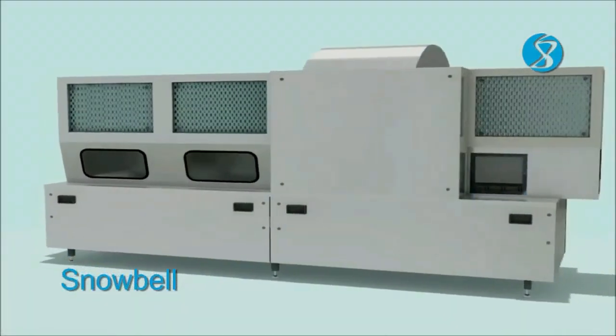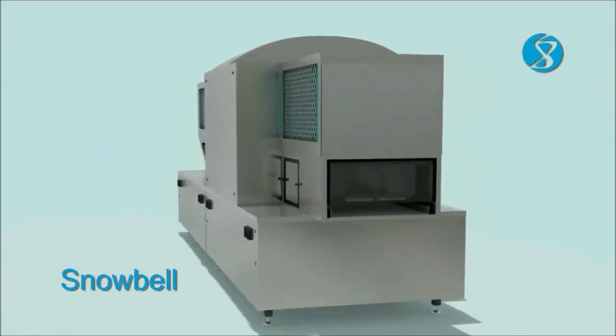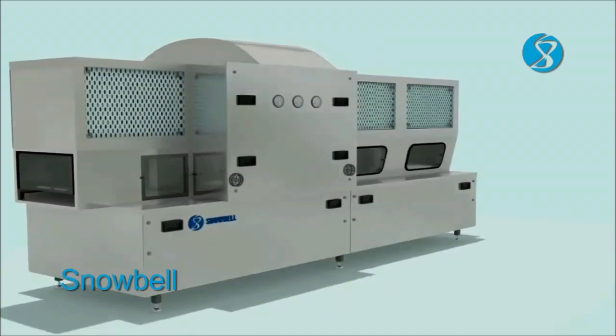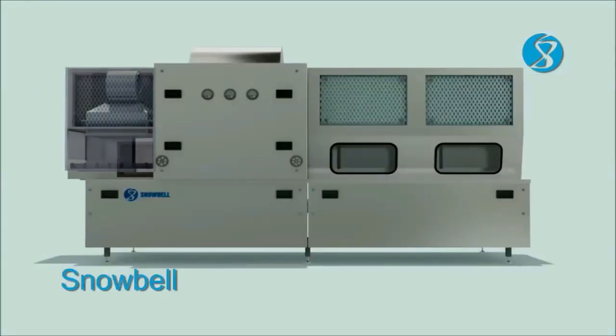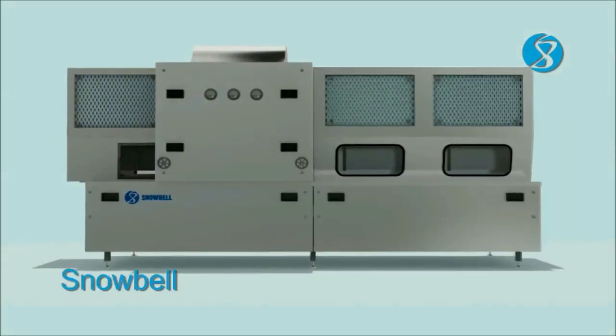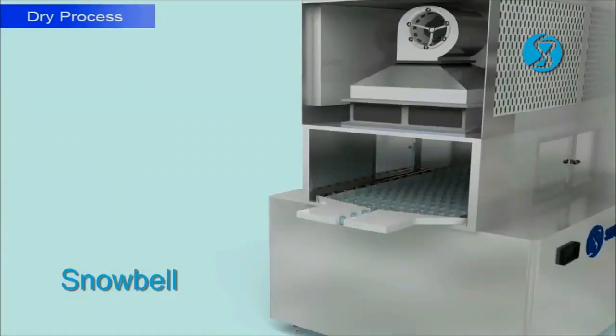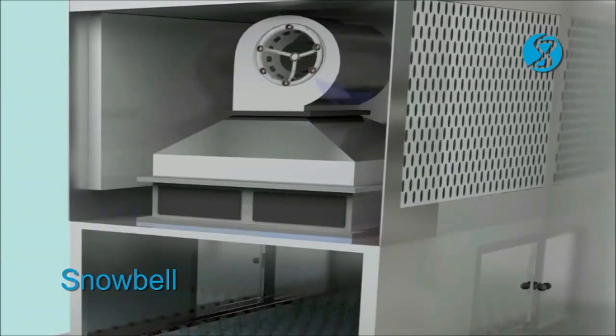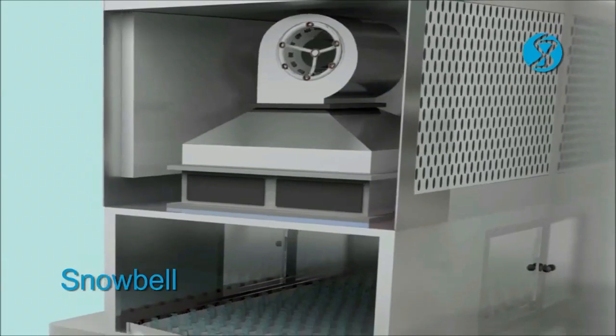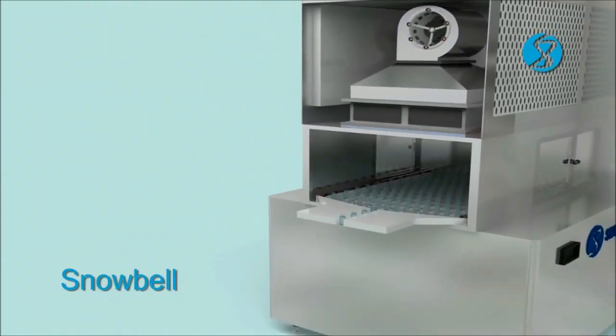Vials exiting the washing machine are further processed by sterilizing and depyrogenating tunnel. The vials are carried by a conveyor into the first chamber called drying zone. Room air is pulled in through a 5-micron filter by a blower and is forced down through a sub-micron filter at a controlled velocity onto the batch of the vials moving in the tunnel.